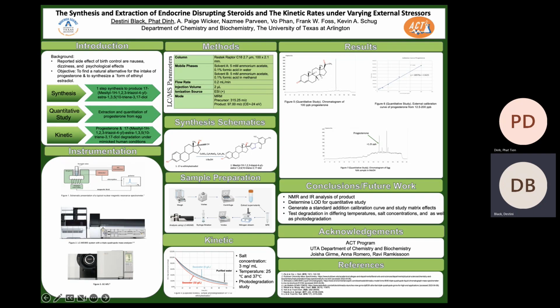Referring back to figure 7, as you see, there are other peaks in there, which are different components of the eggs. And we want to study how those affect the progesterone peak itself. And lastly, we want to look at the degradation in differing temperatures, salt concentrations, as well as looking at the photodegradation study for our kinetics.